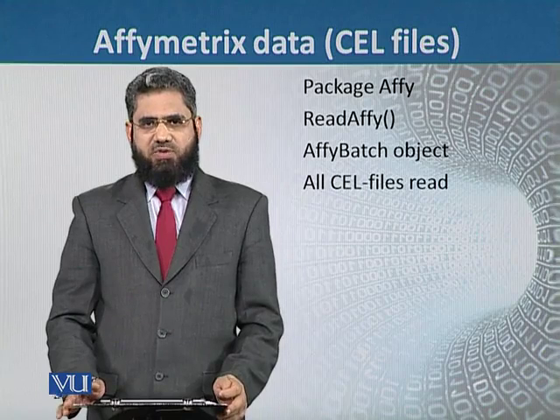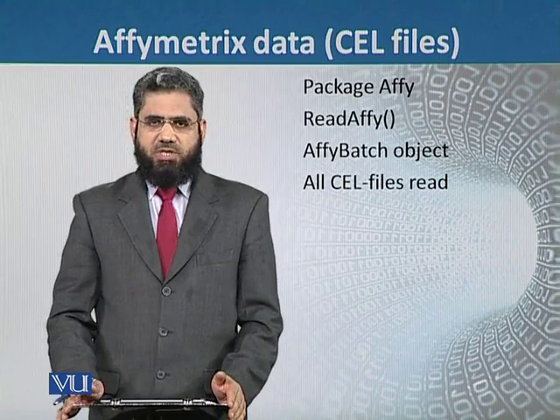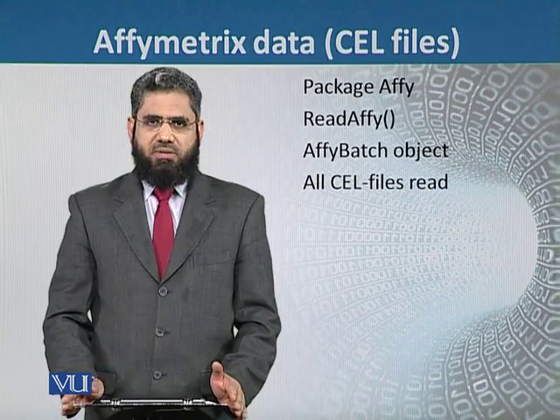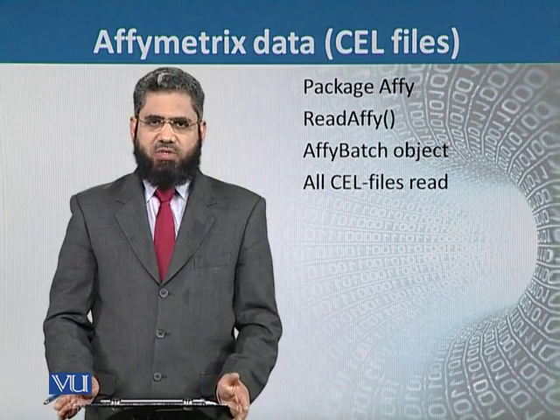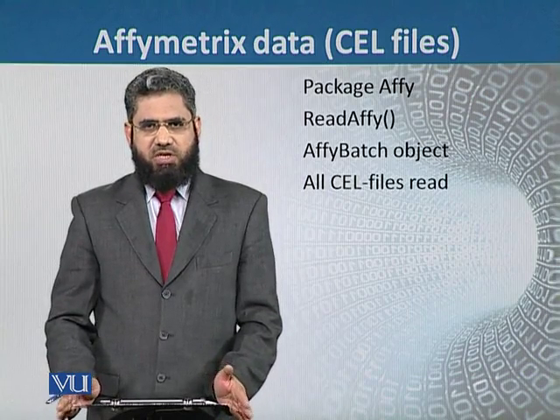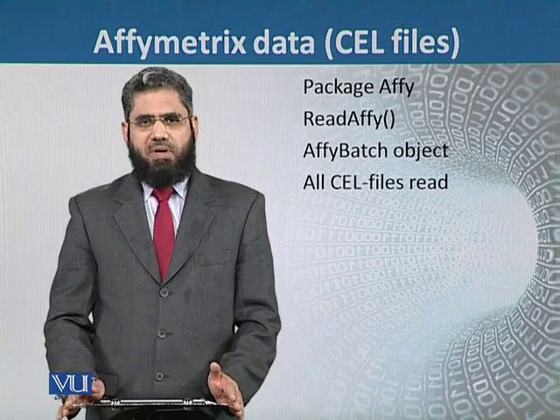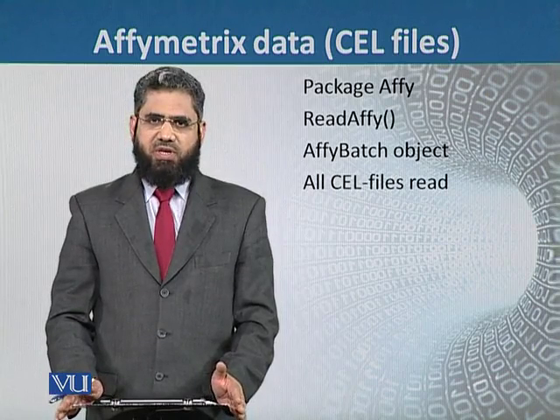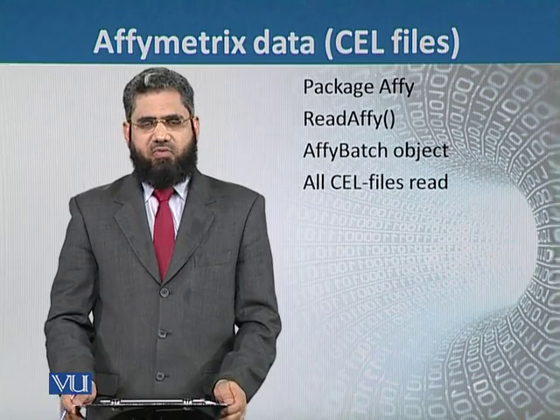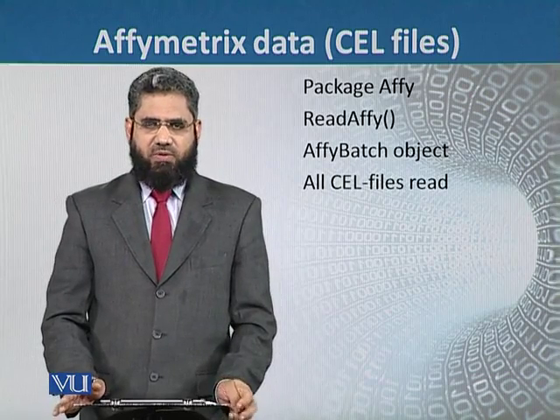So first we isolate the total RNA, and then we convert it into cDNA, because if the RNA number present within the cell is, for example, gene 1 has 500 RNAs and gene 2 has 30 RNAs, then when we convert the RNA to cDNA, the number will remain the same. Gene 1 has 500 RNAs, and the cDNA also has 500 molecules.